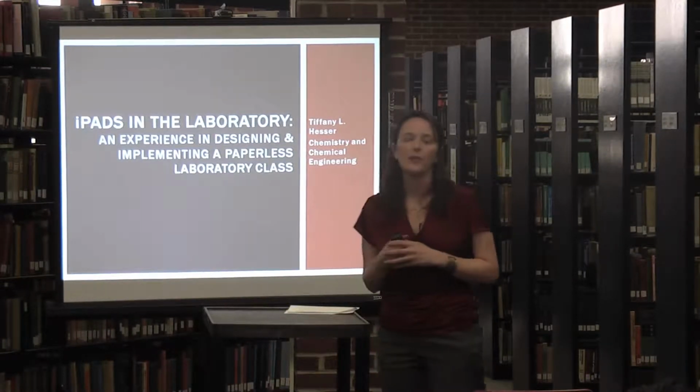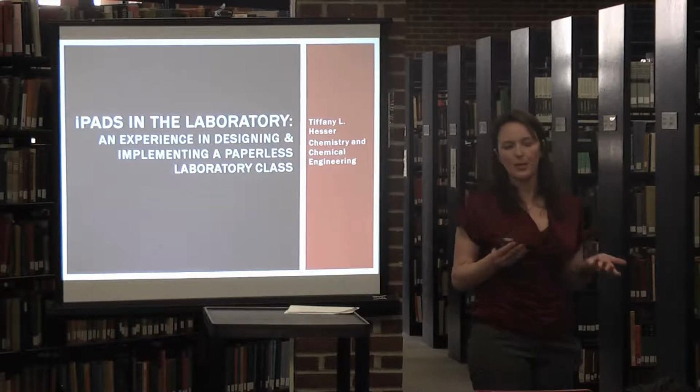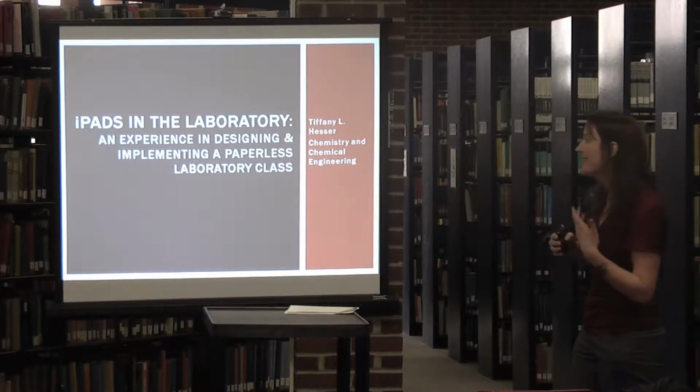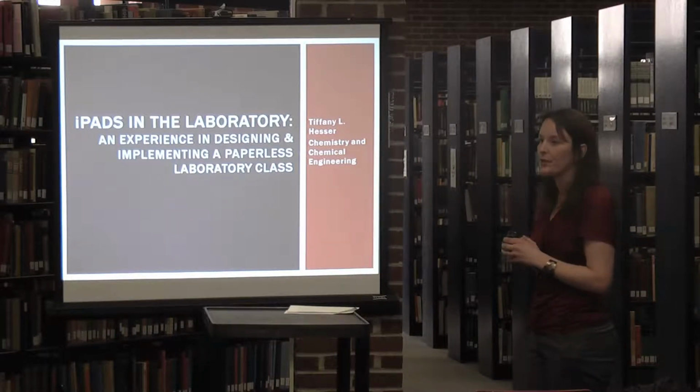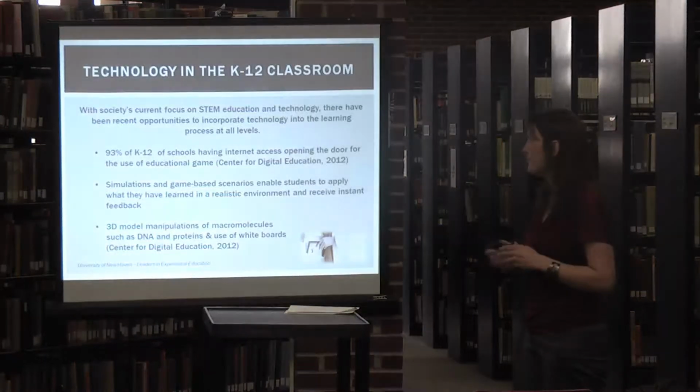Here what we did is we incorporated iPads into the laboratory. So I'm going to share with you our experience in incorporating it into the lecture, but mostly how we incorporated it into the lab to create a paperless lab environment.